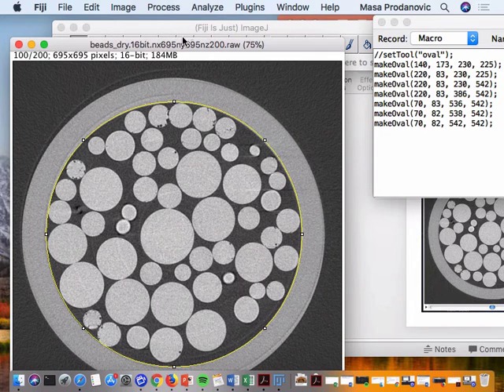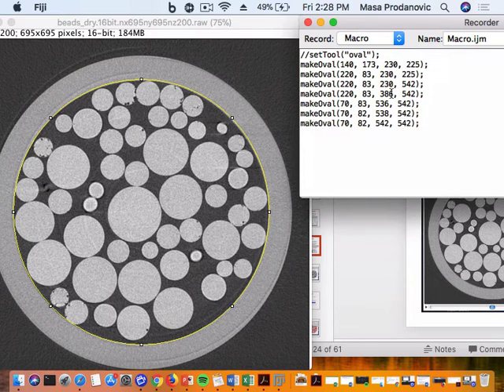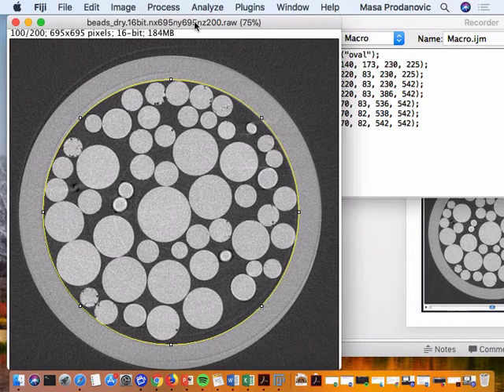Some automated selection of a circle might not be a bad idea. So this is now 542, 542, so that's a circle. If I'm off by 1 or 2, you might not be able to see, depending on how good your glasses are. Mine are never good. So you might want to monitor here that you actually hit the circle, if that's important. And then remember that it's a manufactured cylinder. So question is, even if somebody manufactured it, what was their precision, right? This is one way to test it.